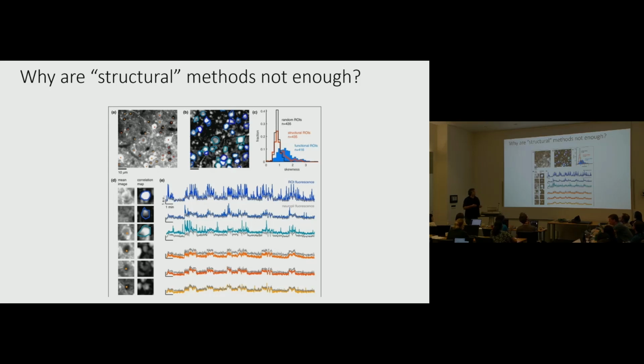So skewness quantifies how often we've got outliers in the transients of these neurons' activities. And you can see the blue ones detected from suite2p have a higher mean, they're more shifted to the right. The red ones detected just by hand, by us, are really not so different from just taking random ROIs literally at random places over the field of view.